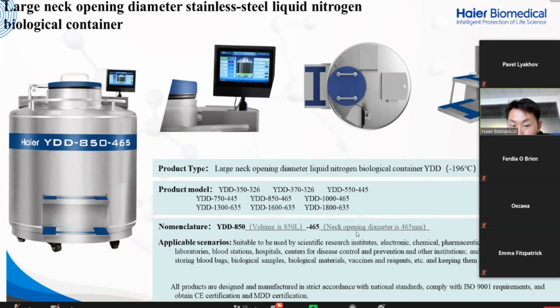For this model, the opening diameter is 465 millimeters. So this model's name is YDD 850465. This is the naming principle they use for every model.